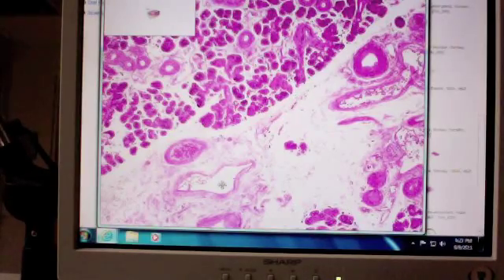In that particular section, there are multiple acini, but those multiple acini belong to a mucus gland. So if I ask you for a single structure, by putting a circle around it, I'm looking for a secretory unit or a secretory acinus. If I don't put any pointers on it and ask you for the structure, I'm asking for that whole structure, and the whole structure is a multicellular gland. Compound multicellular gland.